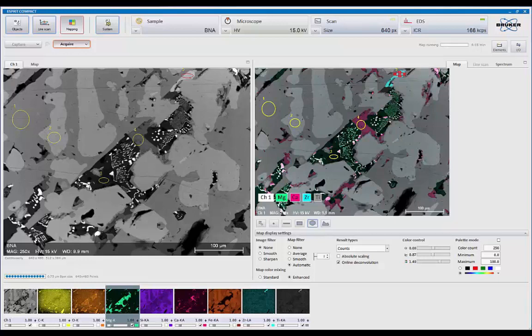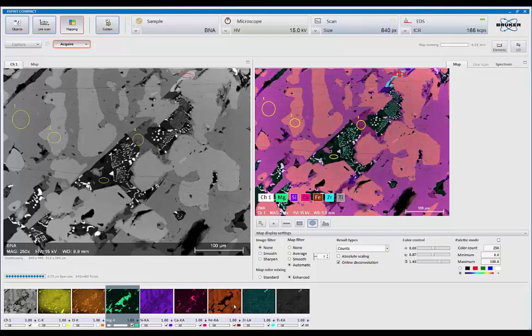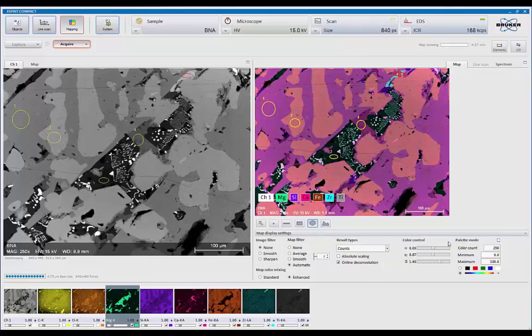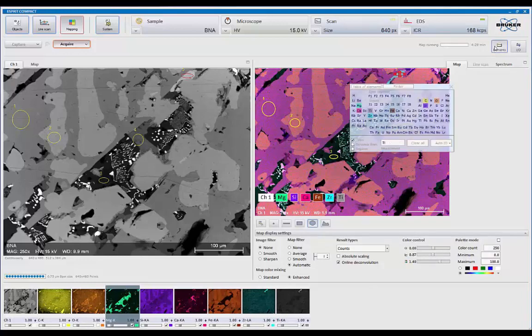So let's look at iron again. Let's bring silicon so we can see exactly where things are happening. And finally, let's also bring up our calcium map. So let's click on calcium. It's there. It's magenta. That's already up.